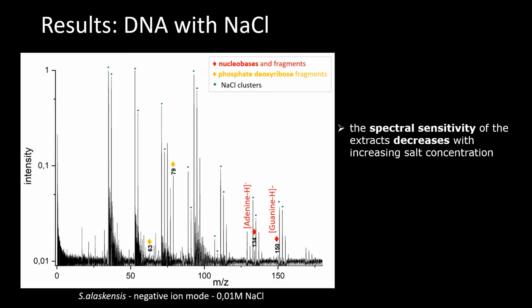Finally, we also investigated DNA in salt-rich matrices. So here on the spectra, you can see that we observed a lower peak for the nucleobases and sugar than in pure water spectra. And overall, the spectral sensitivity of the extracts decreases with the increasing salt concentration.